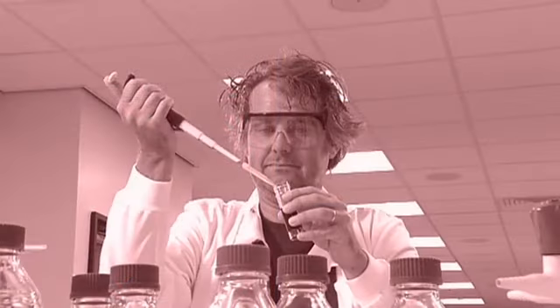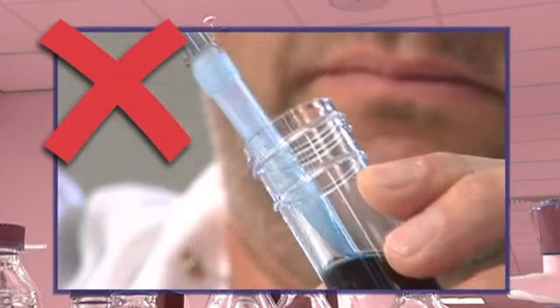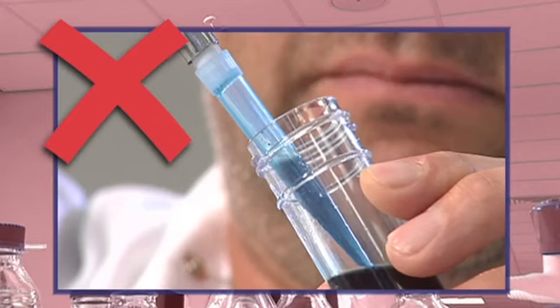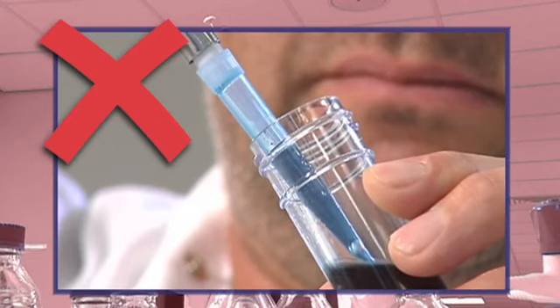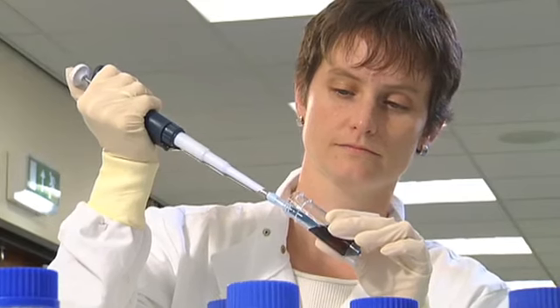When taking up liquids, don't simply let go of the push button. The liquid can be sprayed around the inside walls of the tip and up into the pipette body, causing inaccurate volume dispensing and pipette contamination. Make sure you release the push button in a controlled manner.